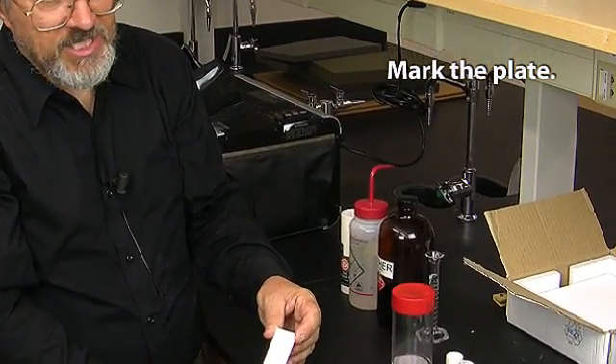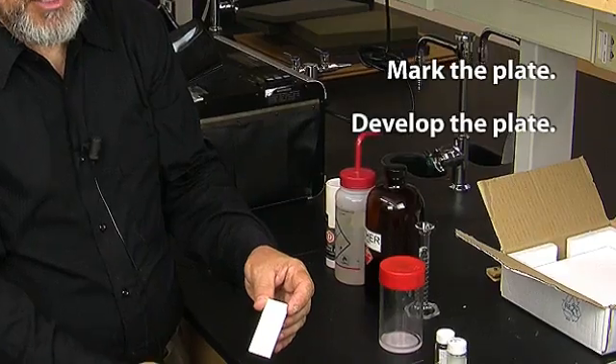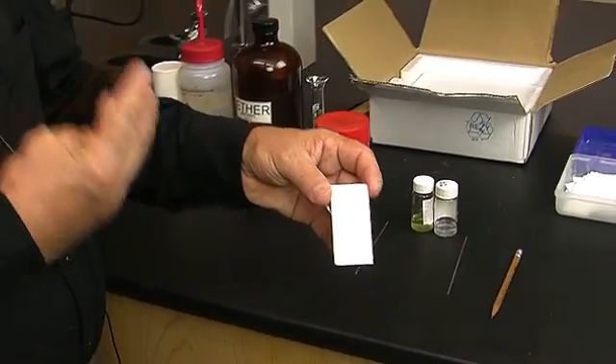The first thing that we do is to mark the plate so that we can load it. The second thing is to develop the plate. The third thing is to visualize the plate. So let's start out by spotting the plate.